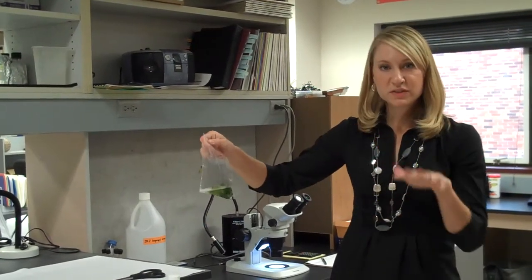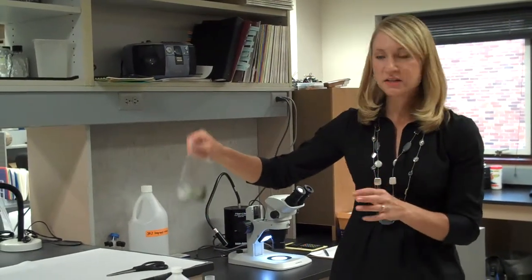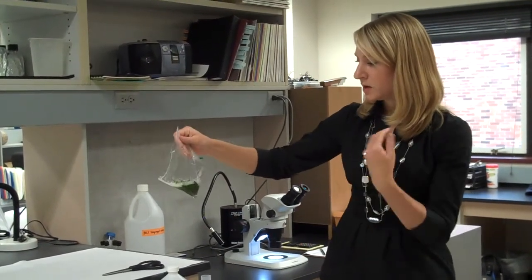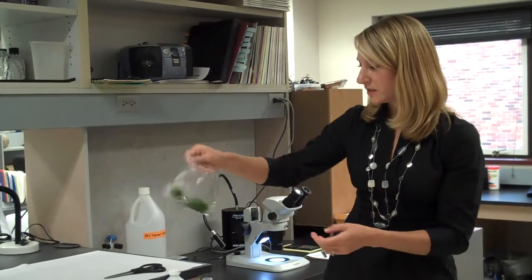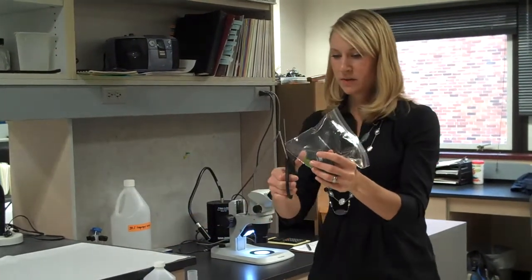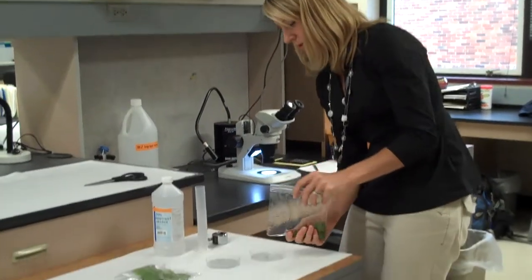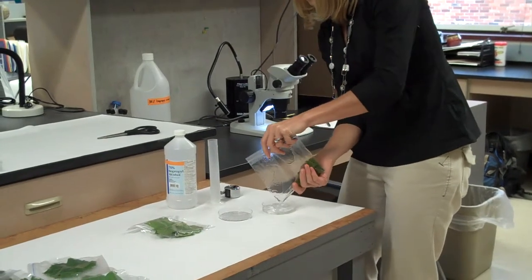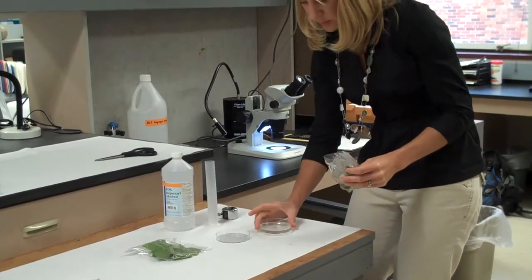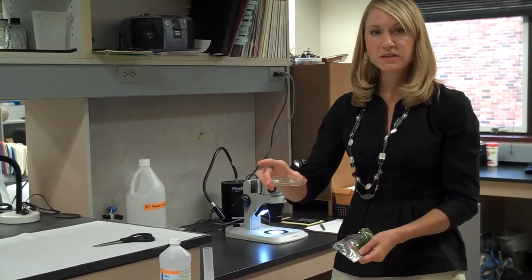If you've done any surface scanning of leaves for mites, you know they hide in the little cracks and crevices by veins, and also under leaf hairs early in the season. This method really helps pull off whatever insects or mites are on the leaves. Once you have that done, snip a corner of the bag with scissors and pour the solution directly into a petri dish, making sure the leaf pieces remain in the bag. That sample can now be put under the stereo microscope to look for rust mites, predatory mites, or thrips.